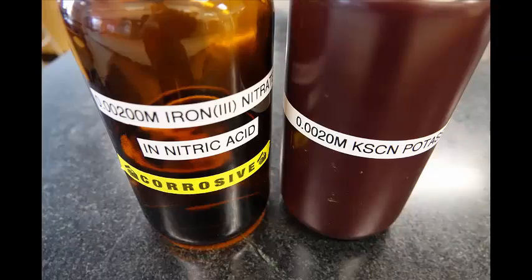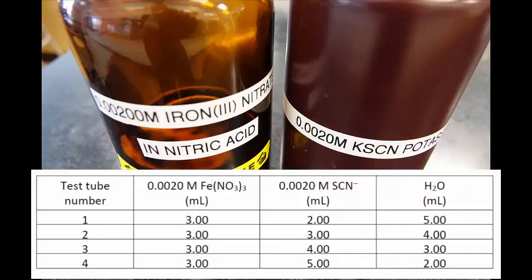For this part, you will repeat the procedure from part 1, but with the test tube volumes given to you in part 2. You're only making 10 milliliters of solution in part 2. Also note that you will be using the 0.00200 molar concentration of iron this time, and this low concentration is what will ensure you reach equilibrium instead of completion.